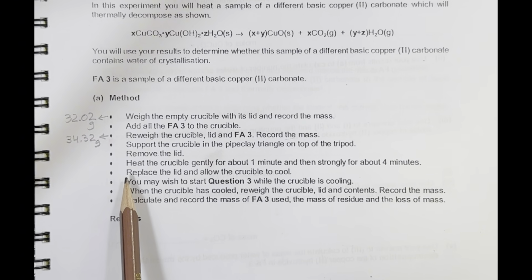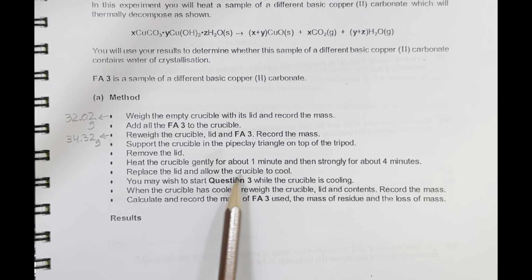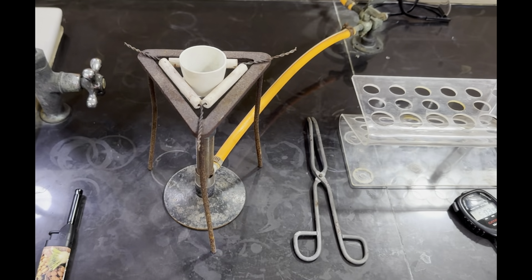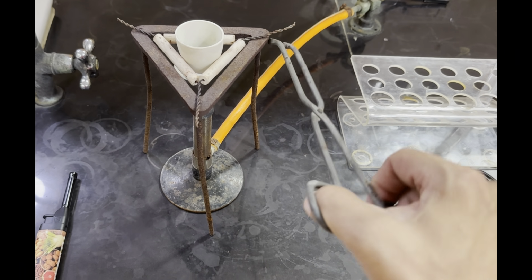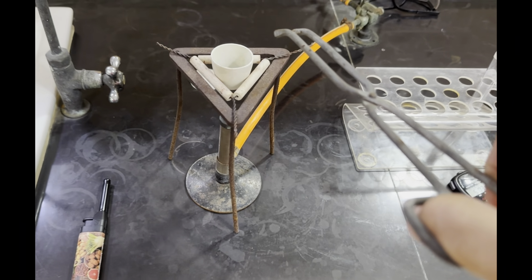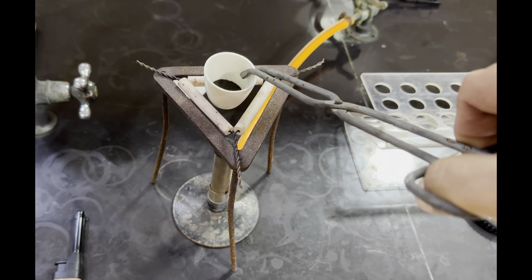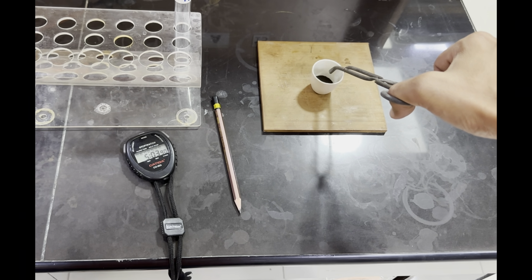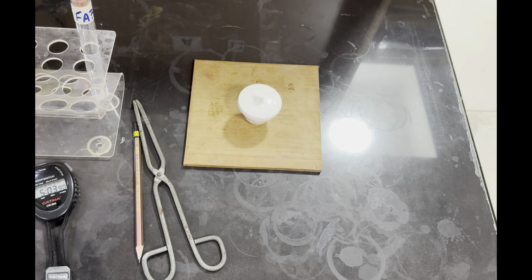After heating for 5 minutes of total time, replace the lid and allow the crucible to cool. Now once you want to remove this crucible, you will use this pair of tongs because it's hot or you might get your fingers burned. You will hold like this from the wall. You will take this to the heat-proof mat, and then you will replace the lid and allow it to cool down.